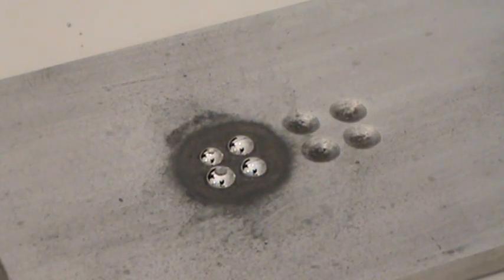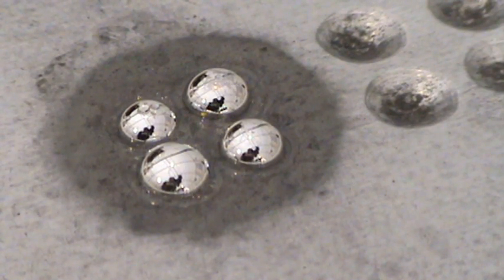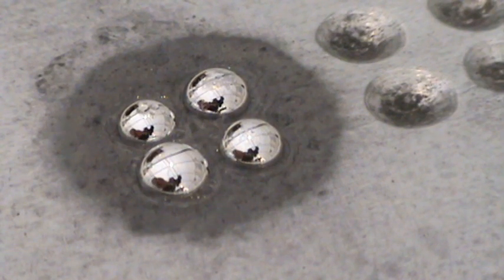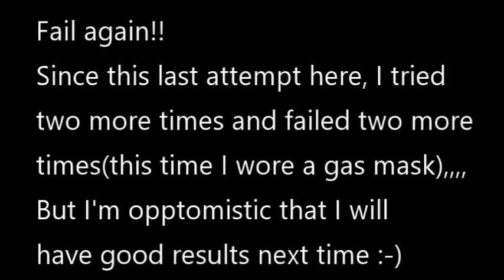Alright, well, let's see what happens. It's been about eight minutes so far — a little bubbling. Still a little acid around the edges.